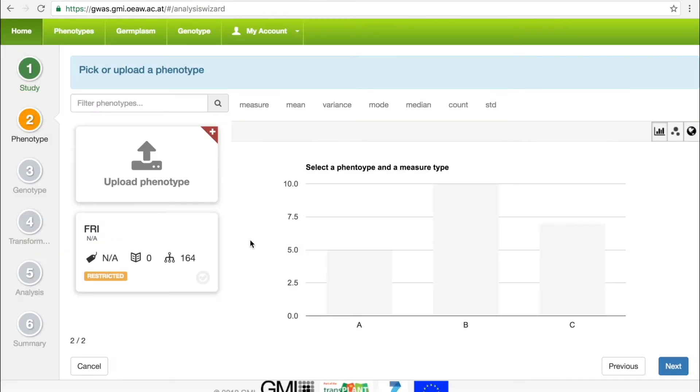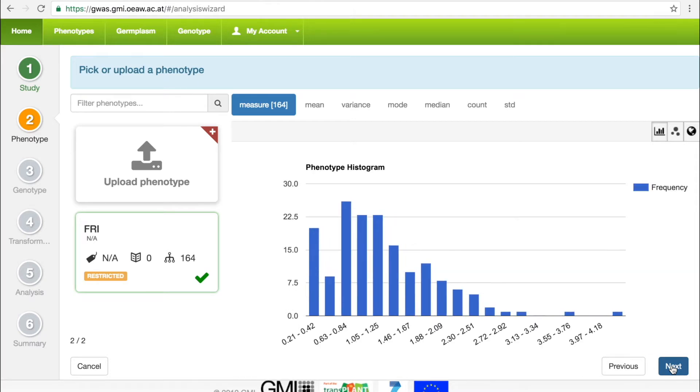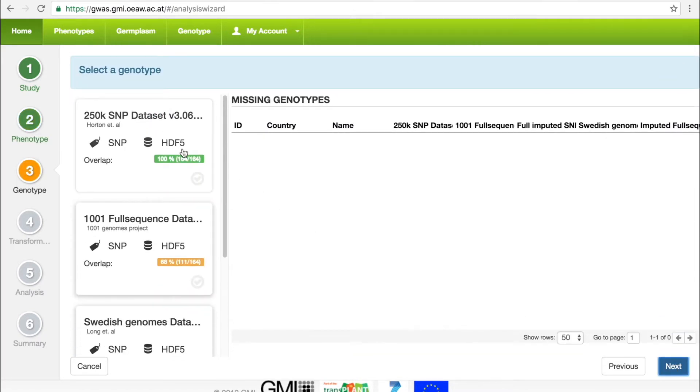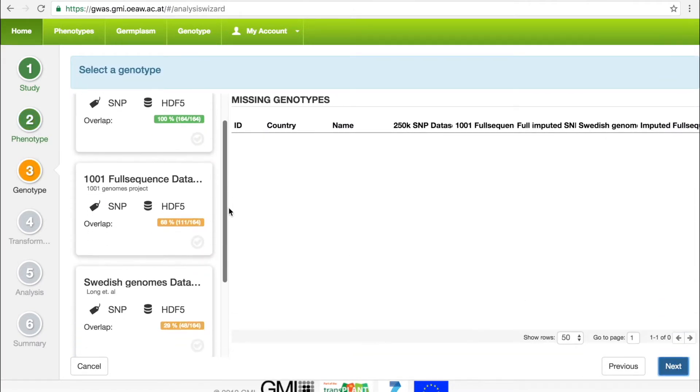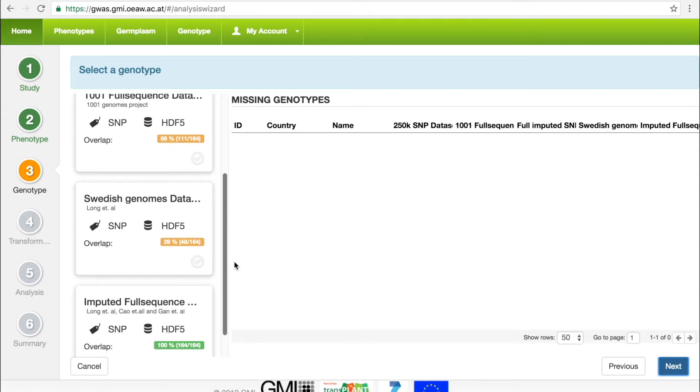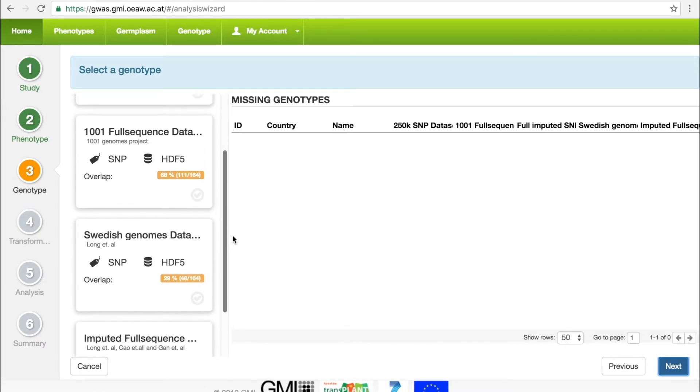The user must now select the uploaded phenotype, and in the next step we will choose a genotype. The GWAS Portal provides several different genotypes to choose from, and since not all of the phenotyped accessions will be found in each genotype set, we display the percent overlap between the two.